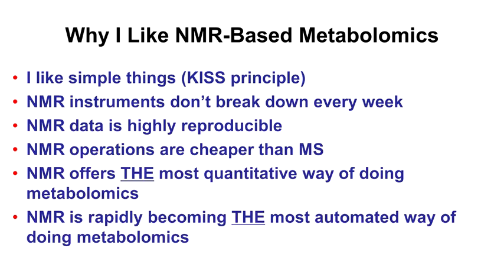Why am I talking about NMR-based metabolomics? It's because I like it. I like it because things are simple. So the KISS principle: keep it simple, stupid. NMR is actually a relatively simple process.